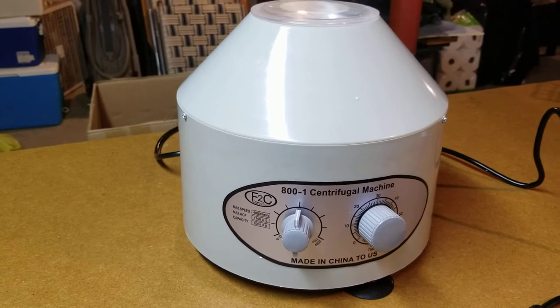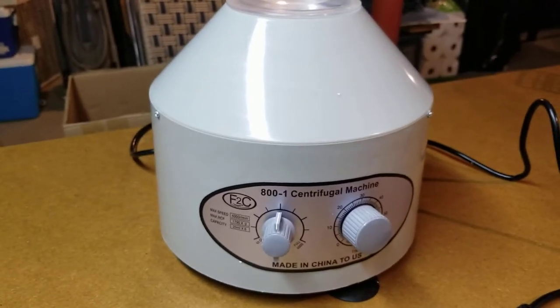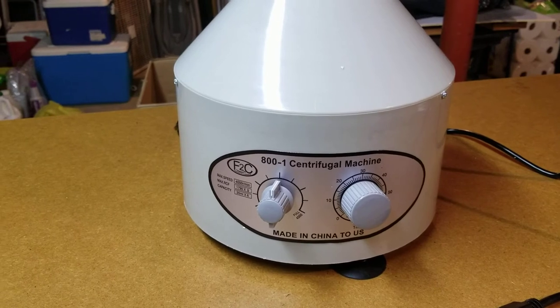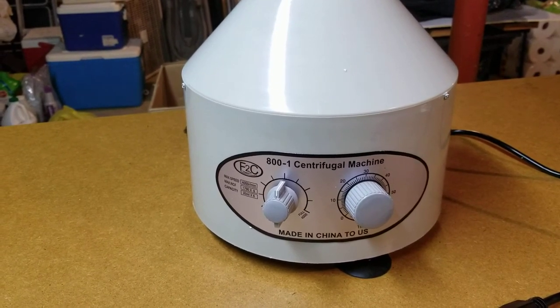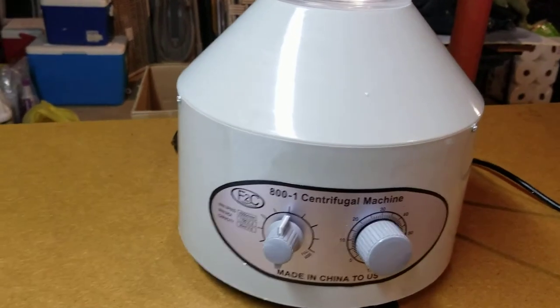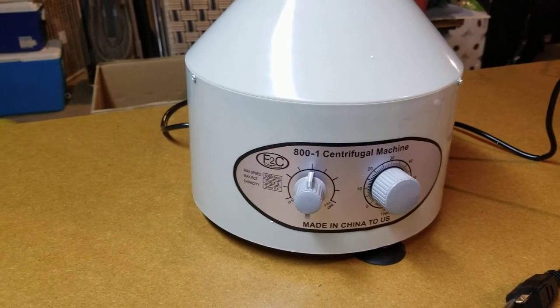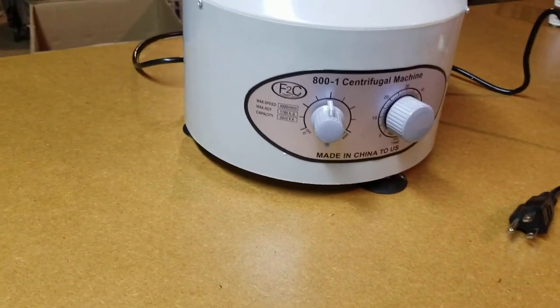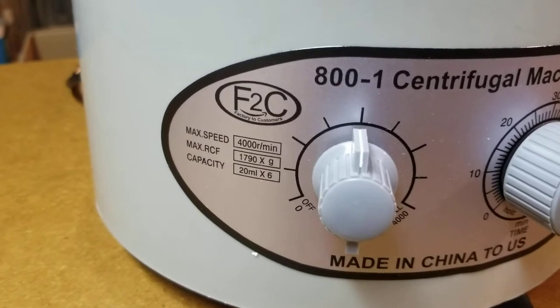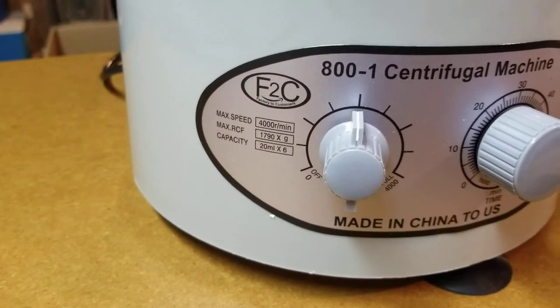Superdeal is actually the name of the company that sells it, and I found that there are different companies selling what appears to be the exact same model. It's made in China and runs off regular US 110-volt outlets. Specifications include a timer that goes up to 60 minutes or continuous mode, and the highest speed is 4000 RPM with eight steps in between.